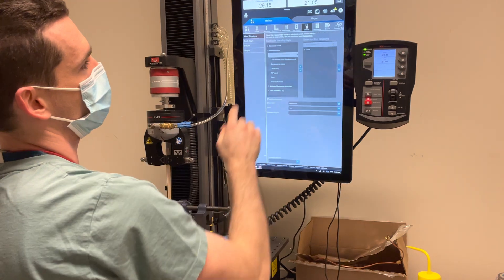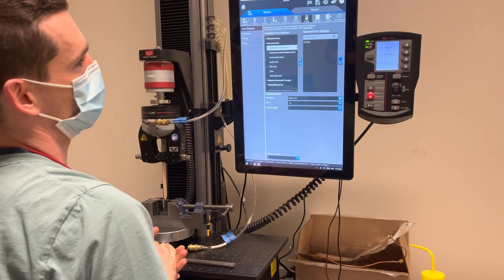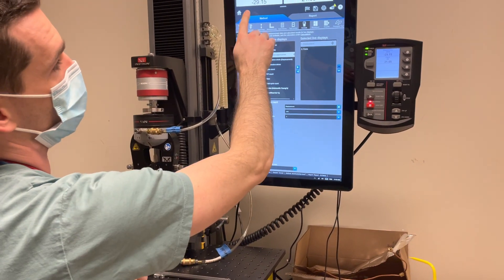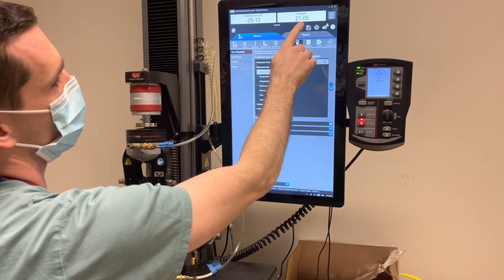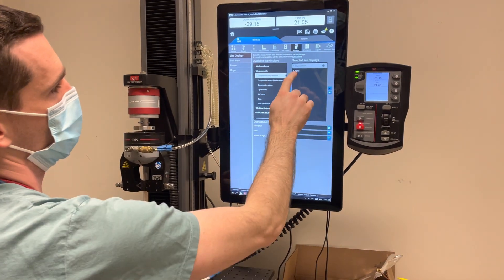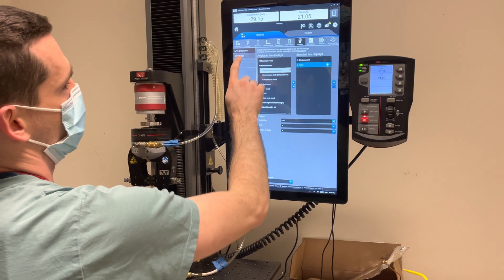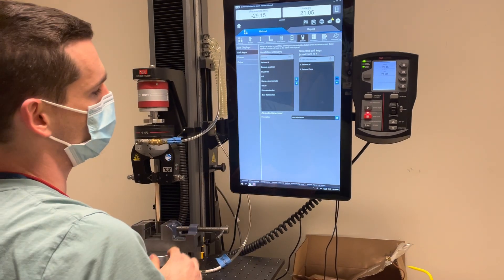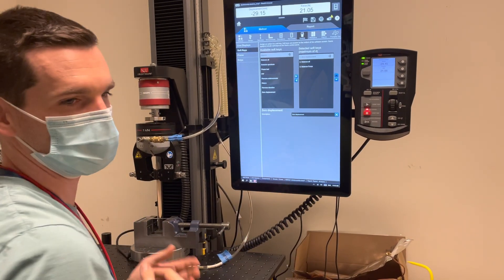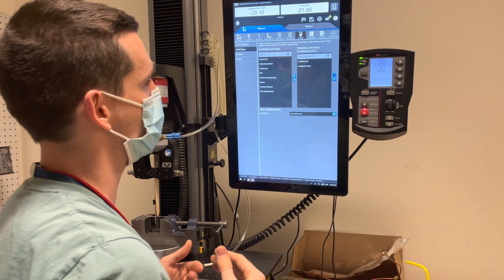Next, in the console, the live displays are going to be the two on the top: displacement and force. I want to change the force to newtons here. For my soft keys, those appear down here and allow me to zero out displacement or load at any time.